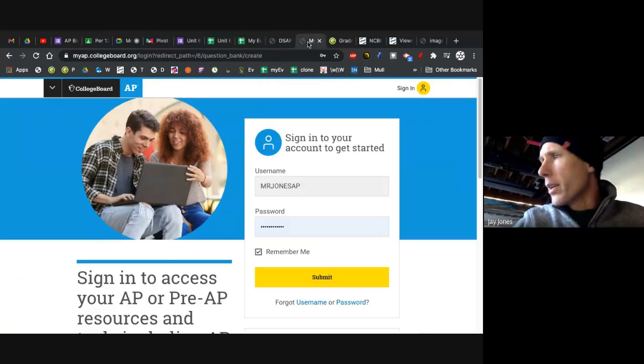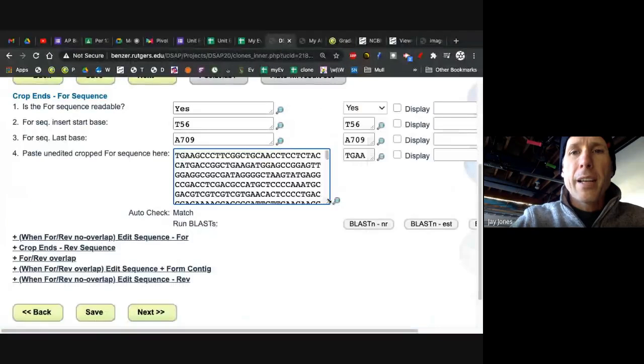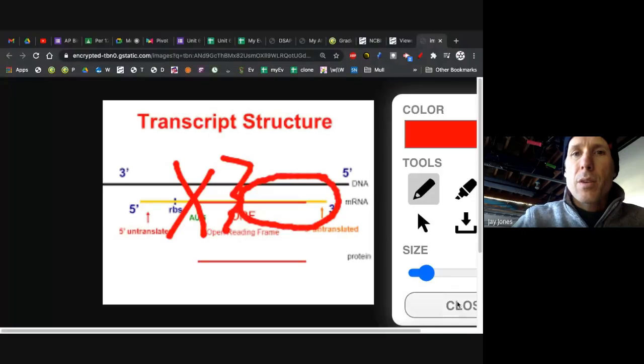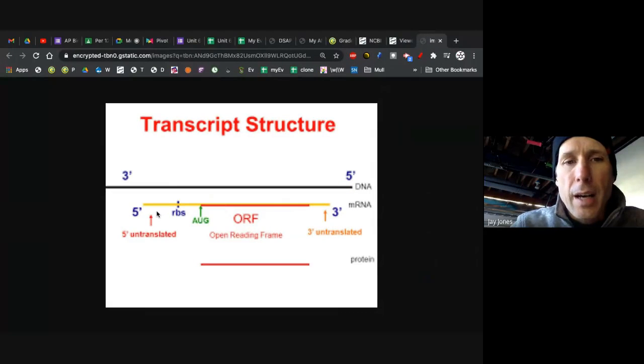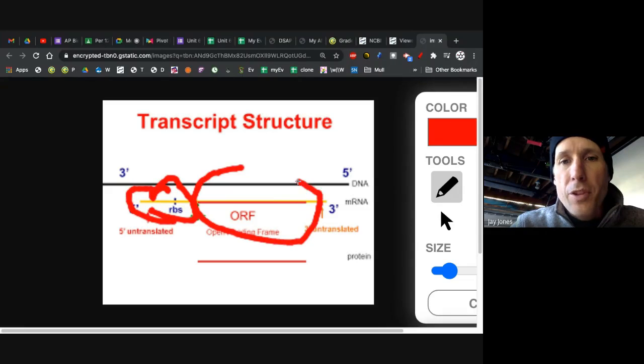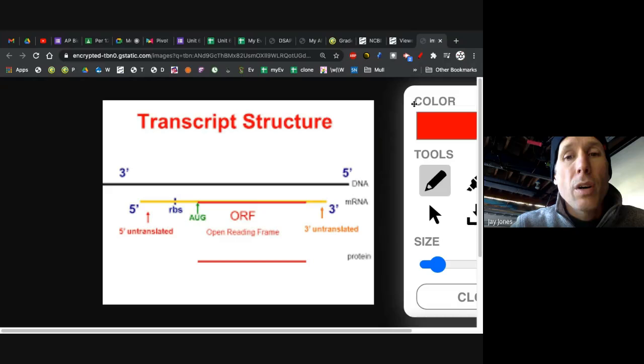Okay, we are recording. What we're particularly looking at here is PC3, insofar as it's a partial sequence. So here we have a messenger RNA. With PC1, it was very clear. We had a 5' UTR, that's this area right here. We have an open reading frame with a start and a stop, and we have a 3' UTR. Very straightforward.